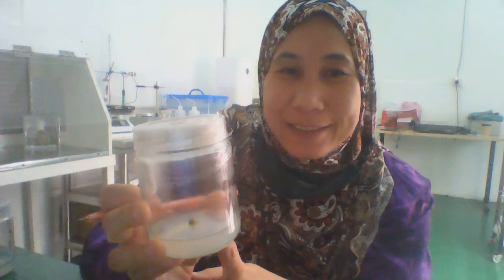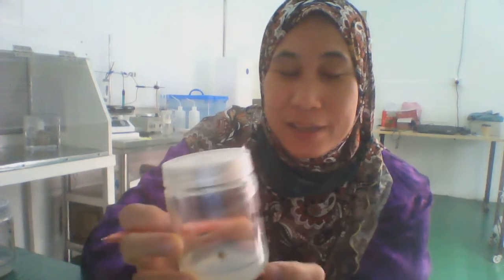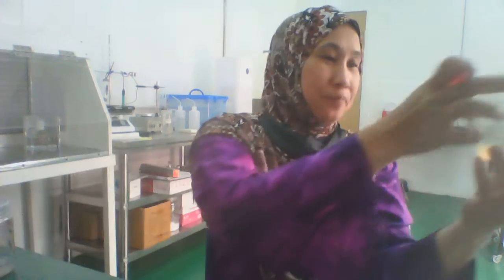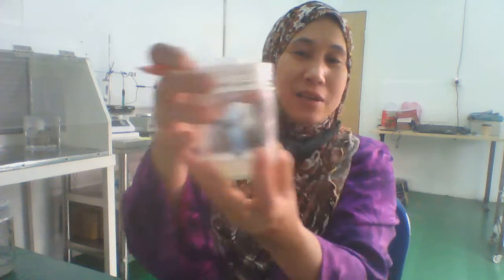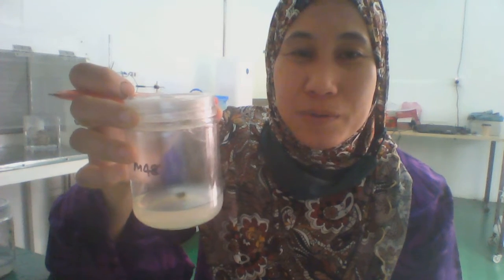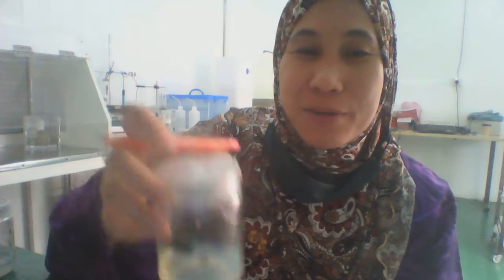So this one is my first successfully cultured from leaf, the callus from leaf, and I did this culture in February, so it took 4 months for the callus to come out and grow into new plants. From many that I did, I actually did many bottles, but only this one survived. So this is my first experience with leaf calluses, so we'll see how it goes.